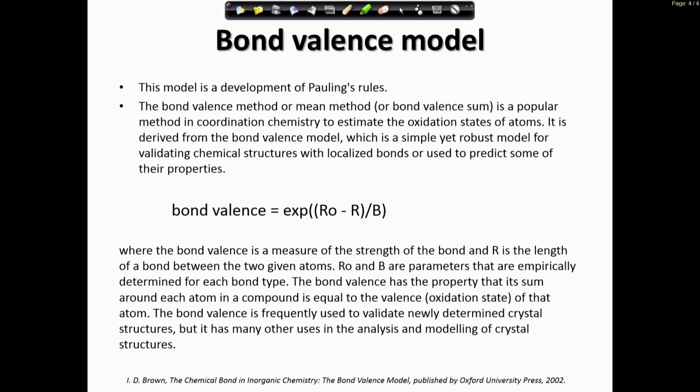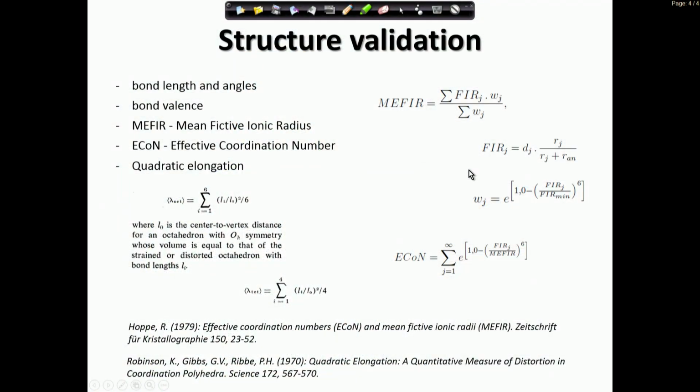If you get a bond valence of 1.3, that's also not 1, but it's not that far off. So there you can think maybe it's okay, probably it's okay, but if you get 3 or 5 or 8, then something's really wrong. So we'll talk about it in the exercises, but I really recommend for inorganic materials to always check the bond valence sum. It allows you to avoid many avoidable mistakes.